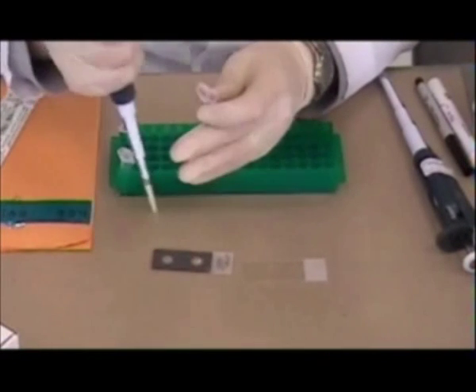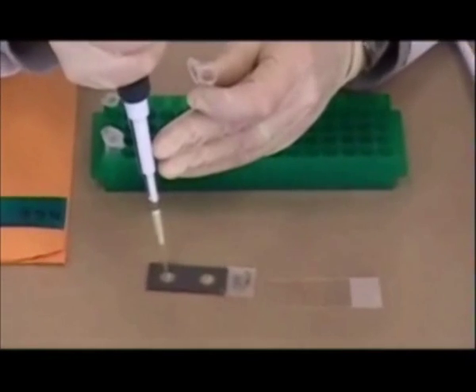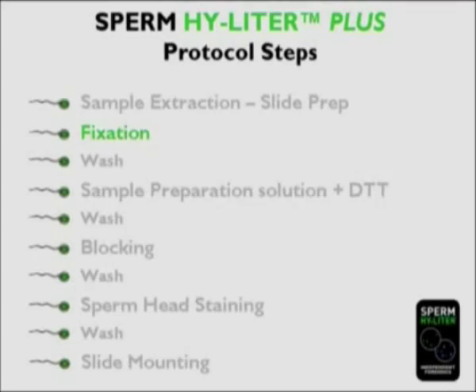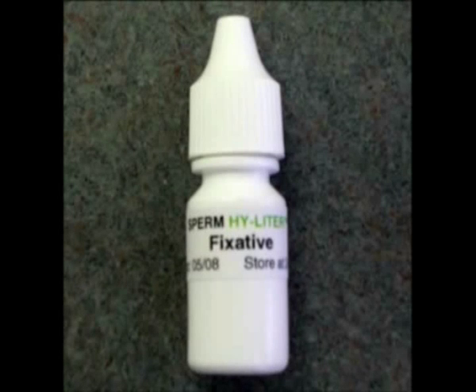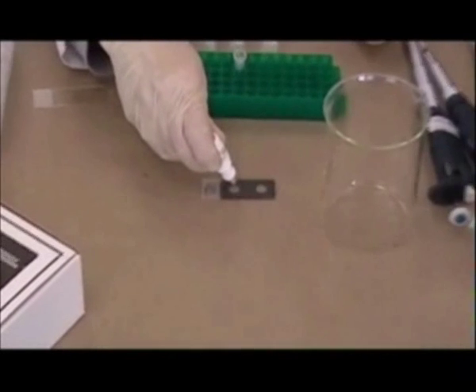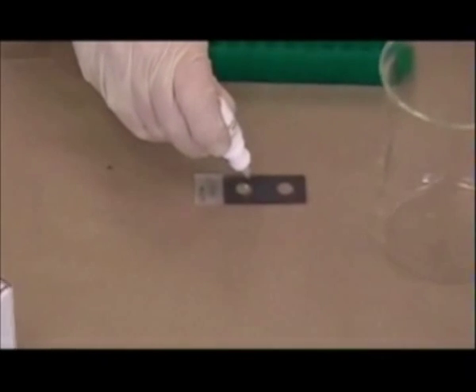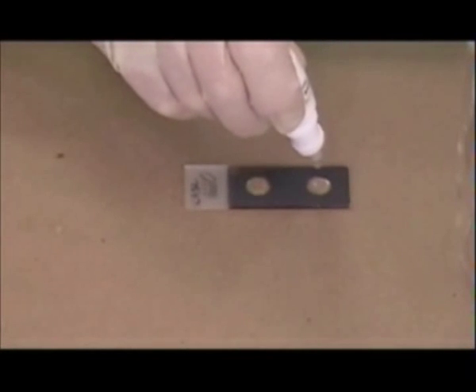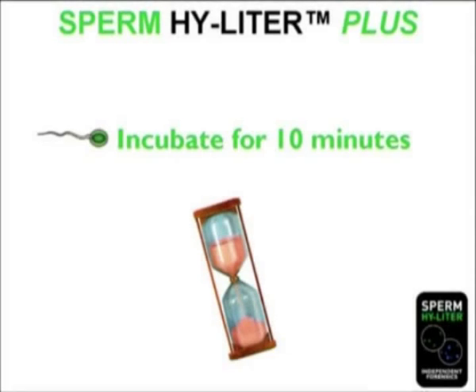Please note that other laboratory SOPs for evidence handling are also compatible with Sperm Highlighter staining. Once the extract has dried, two drops of fixative are added to the sample window from the white capped bottle and the slide is incubated at room temperature for 10 minutes. This adheres the sample onto the slide.